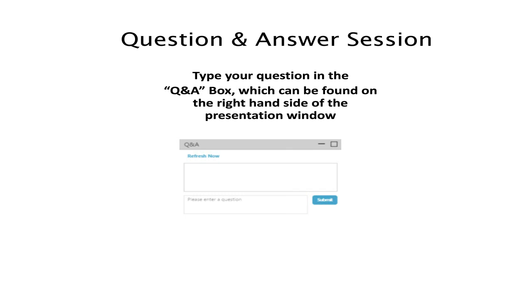Our next question is, settle plates seem to be a measure of surface contamination. Is that correct? Yeah, in reality, it is really a measure of the surface contamination rate, so how fast the surface is going to contaminate. And it is not a measure of the absolute contamination of a certain area. So as I tried to explain, it is a bit odd that we try to understand the air quality by this. In essence, it is a measure of how surfaces will get contaminated over time.